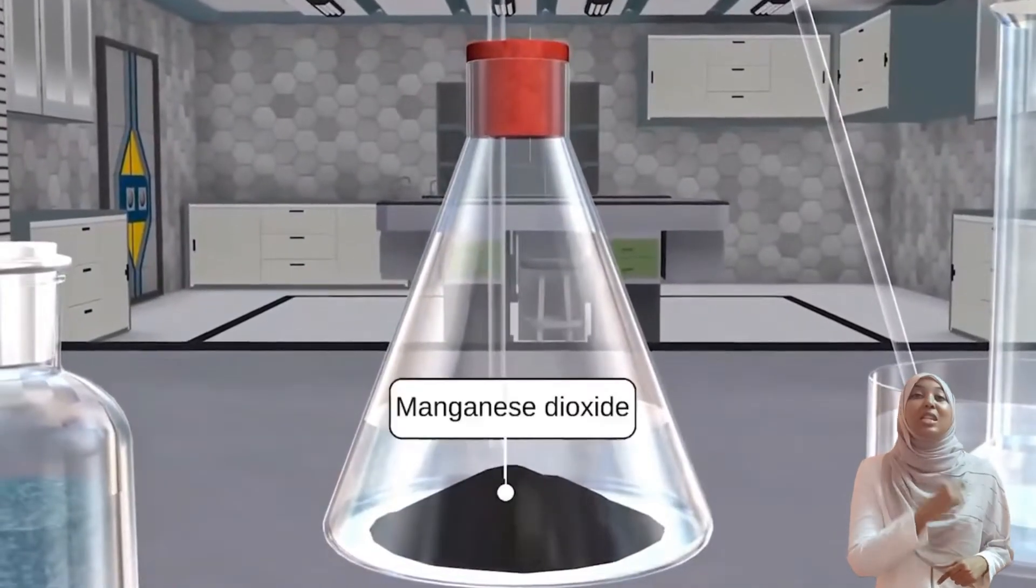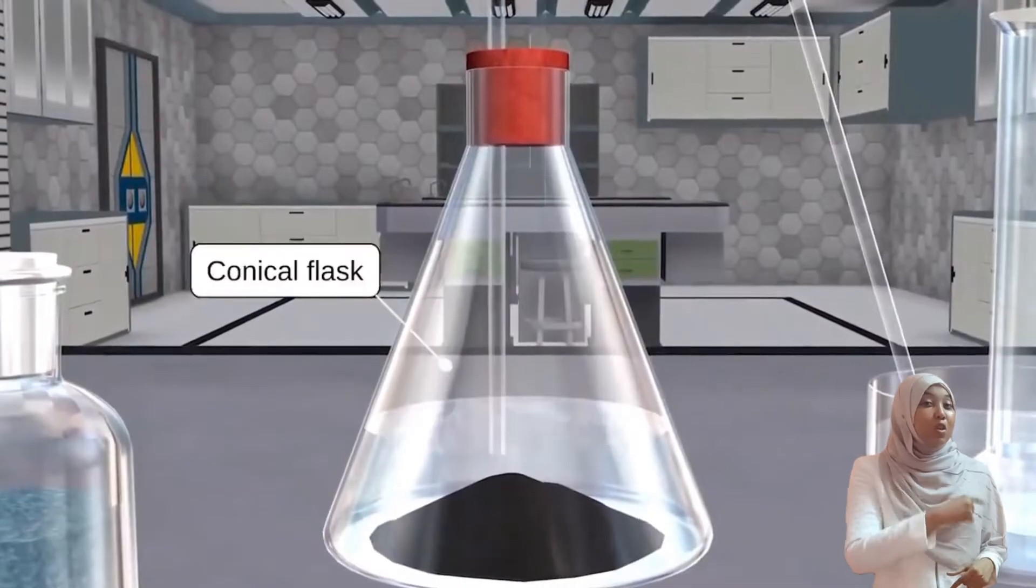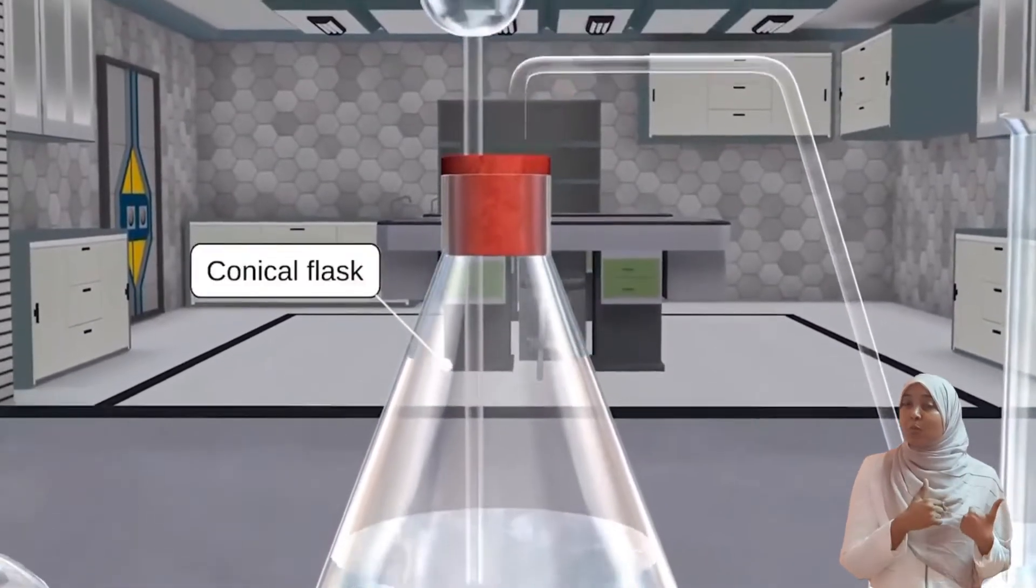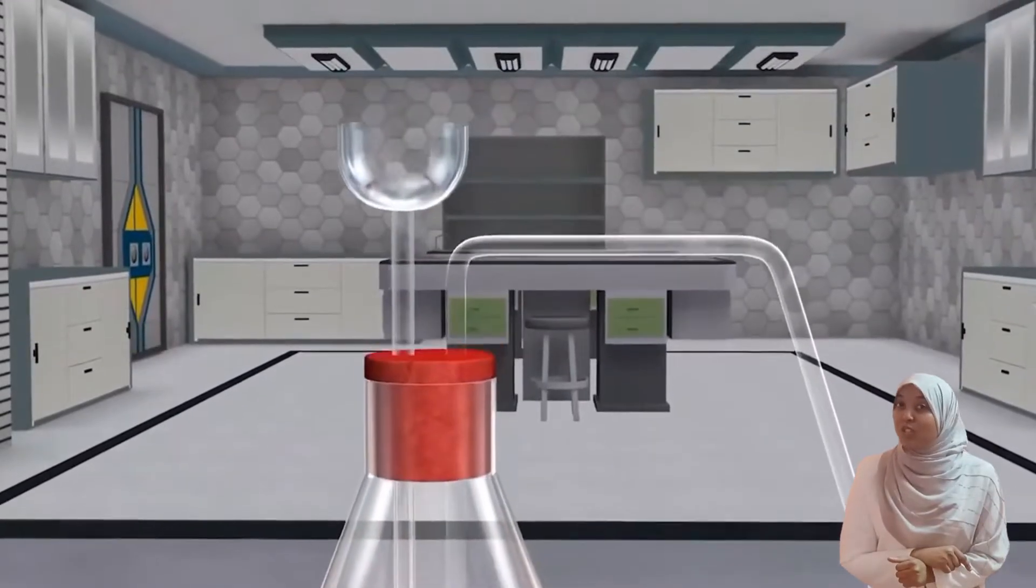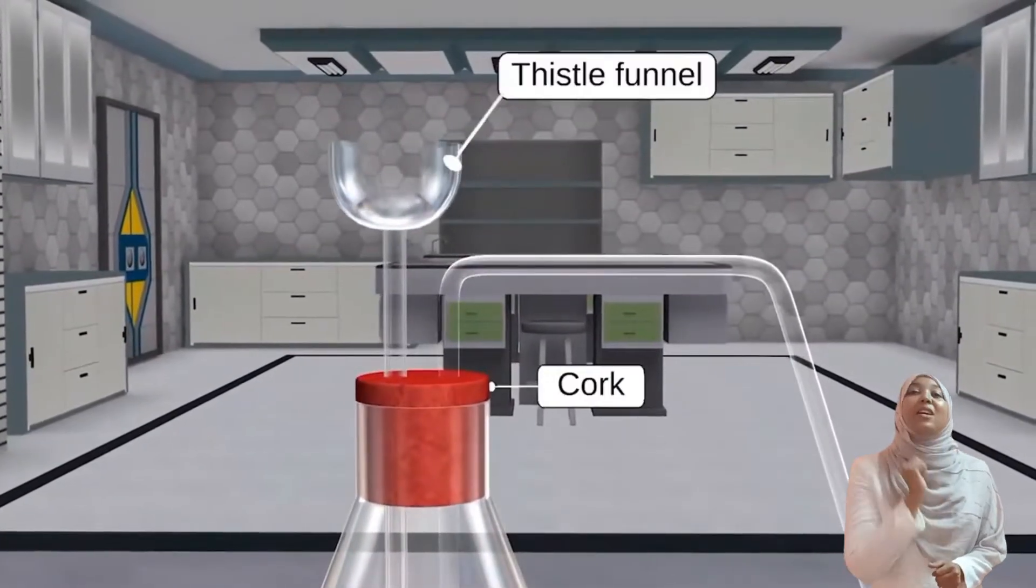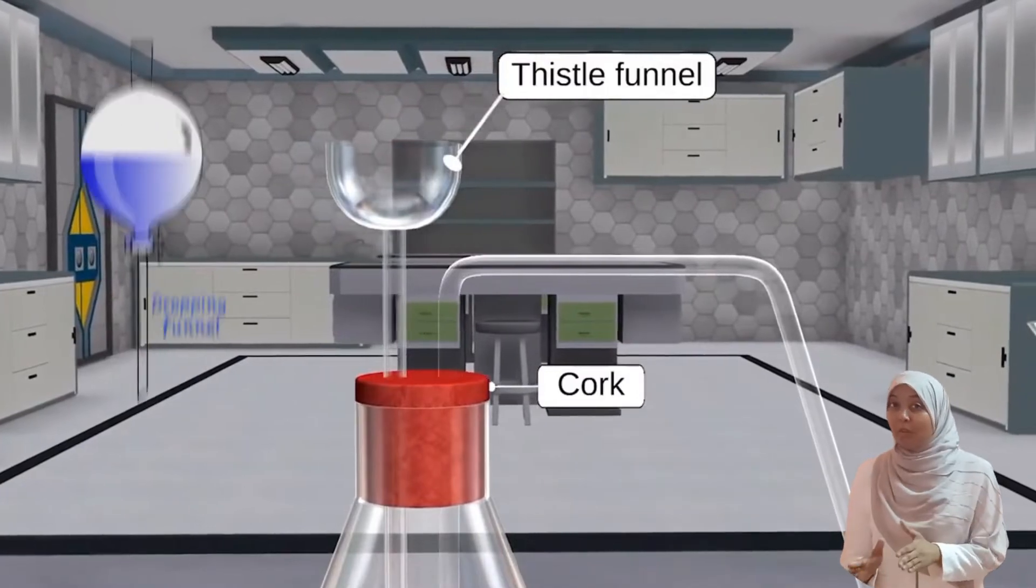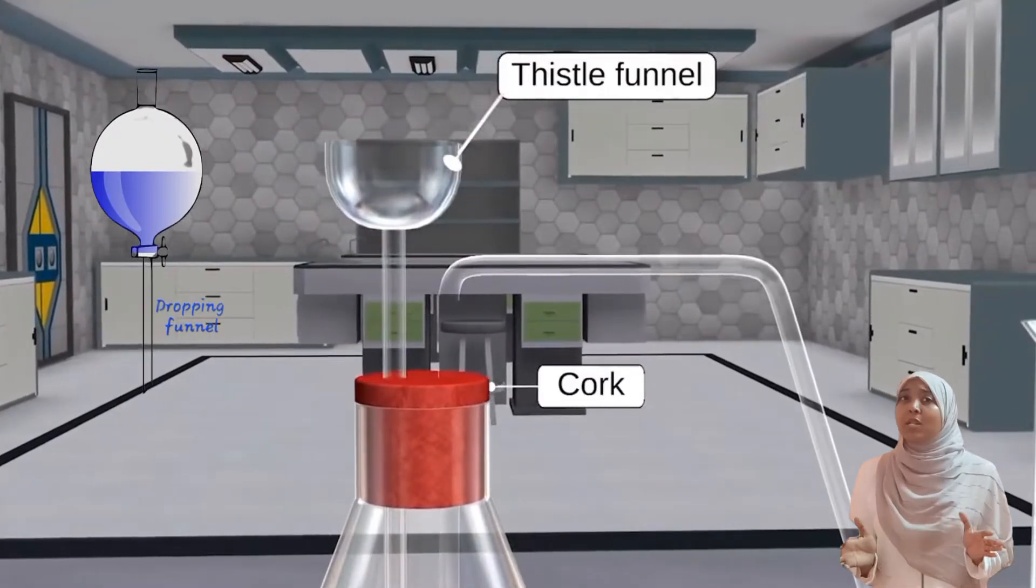In this reaction, the catalyst that is used is manganese 4 oxide (MnO2), which is the black solid you see in the flask. Manganese 4 oxide is going to be in the flask, while hydrogen peroxide will be in the thistle funnel.